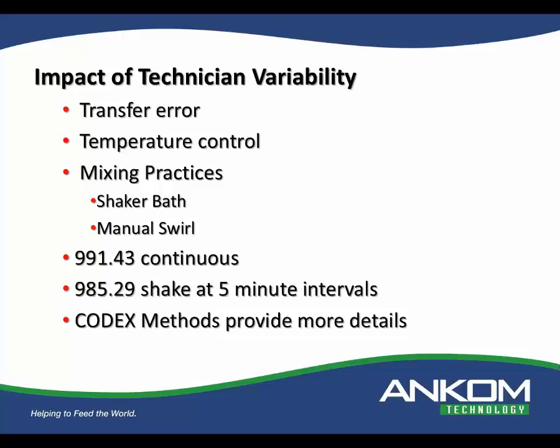How do you do a digestion, multiple enzyme digestion, and then go from, if you will, the digestion phase and then transfer it into, in the case of the conventional method, a 60 milliliter fritted glass gooch in order to do the filtration, because there is that move from one to another. How do you reduce that? And so we're going to be talking about that.